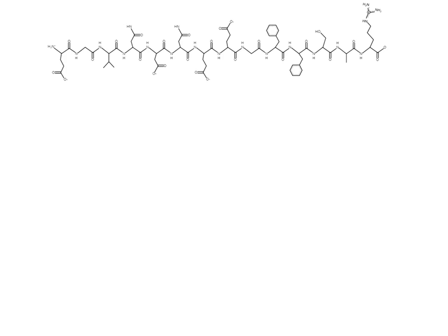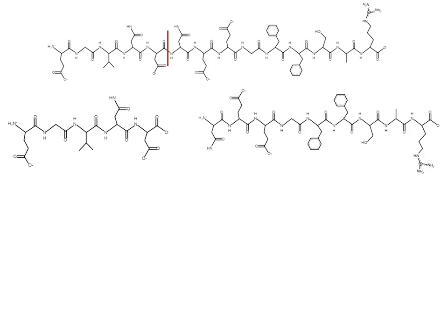First, we need to look at the nomenclature, or the language used to refer to fragments of a peptide. When a molecule of a peptide gets broken during collision-induced dissociation, it usually only forms 2 fragments. Different molecules of the same peptide can get fragmented in different places in the chain, and thus we produce a ladder of fragments. The fragments will be singly charged. So the MSMS spectra can have fragments representing the peptide sequence from the N-terminal end and have fragments representing the sequence from the C-terminal end. As both series are in the spectra, things can get a little complicated.